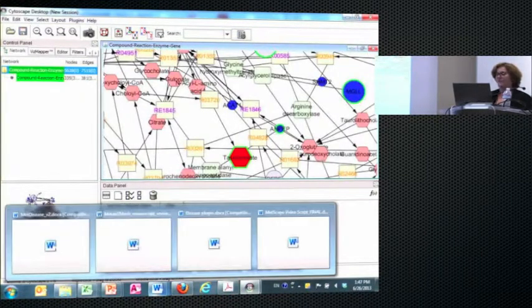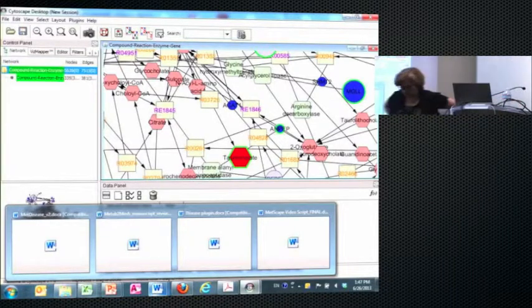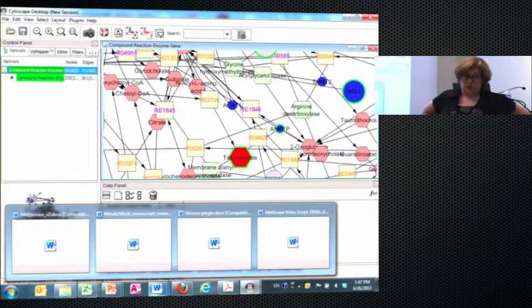Understand how, if it was not in our data set, how is it significant? Okay, sure. It was in the data set. It was in a big gene file which had 40,000 genes. But it was not part of any enriched pathway, okay? It was not one of the genes that were in these enriched pathways, okay?